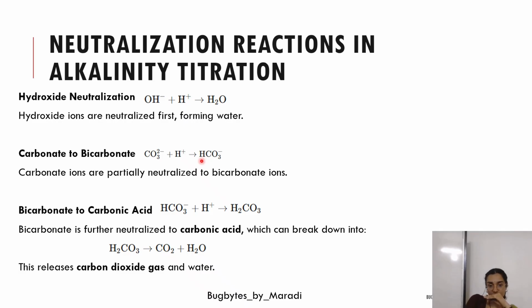Soon after it forms the bicarbonate, the bicarbonate again reacts with the acid to form carbonic acid. This carbonic acid further breaks down into carbon dioxide as well as water. This is how it happens in the normal scenario.